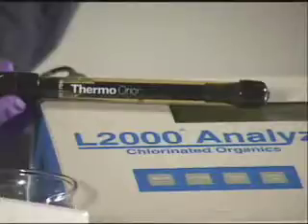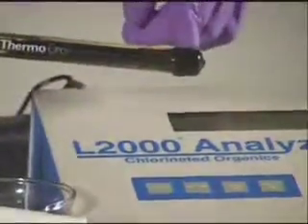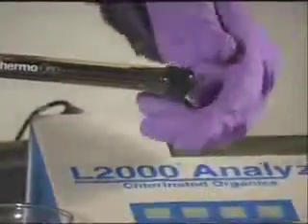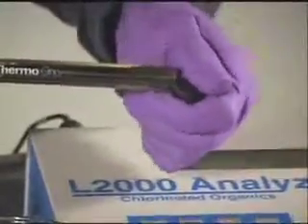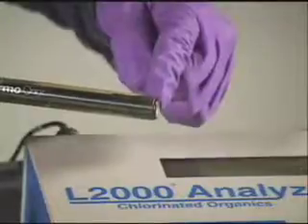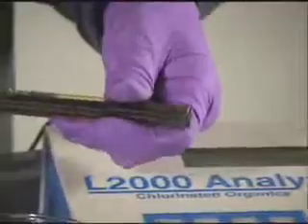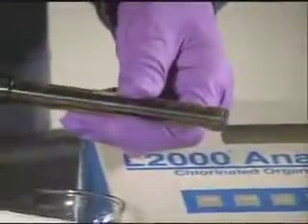At the tip of the electrode is a plastic cover that protects the surface of the electrode sensor. When removing this cover, care must be given so that the surface of this pellet is not scratched or marred in any manner. Failure to protect this pellet may damage the electrode and void any manufacturing warranties.